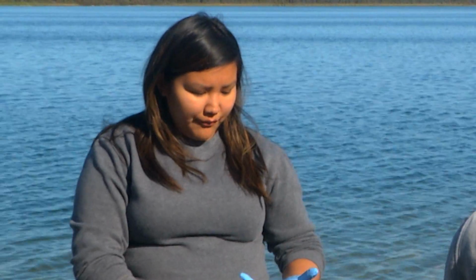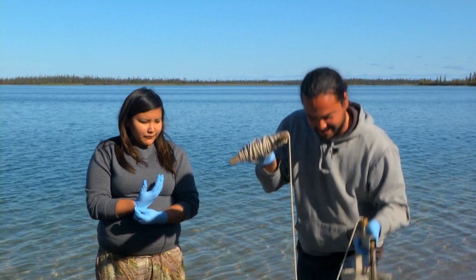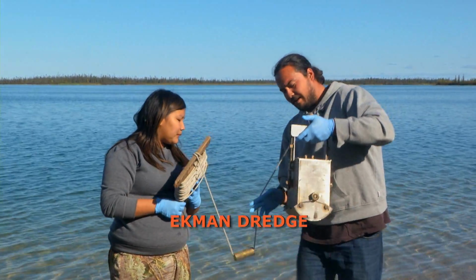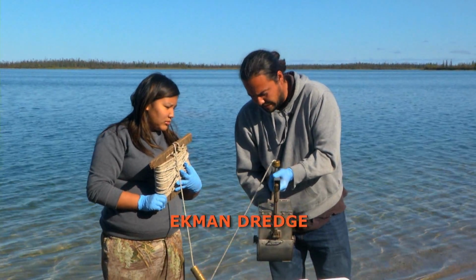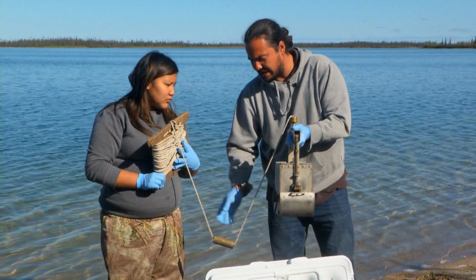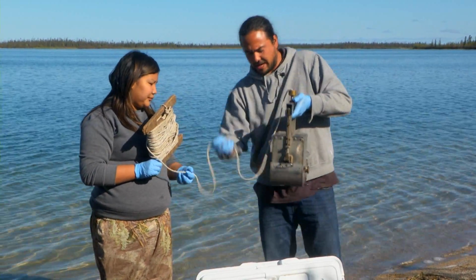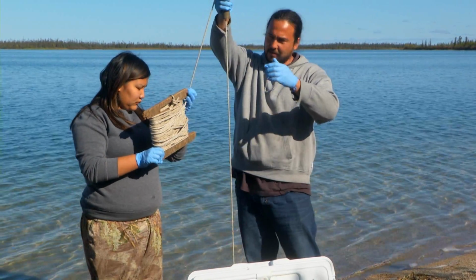And the second part is using the Ekman dredge. Because Wati is a really rocky lake, hold on. We're going to use this here. And at every site we do, we'll have this in the boat, and you want to try to hold it as straight as you can. So when we drop it, you'll actually feel the tension hit the bottom, and you just drop it.